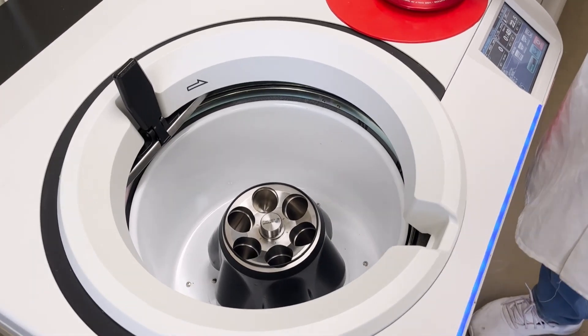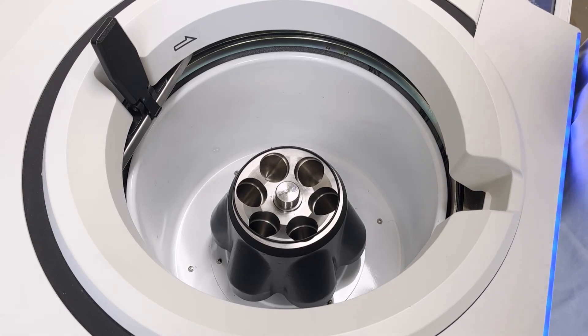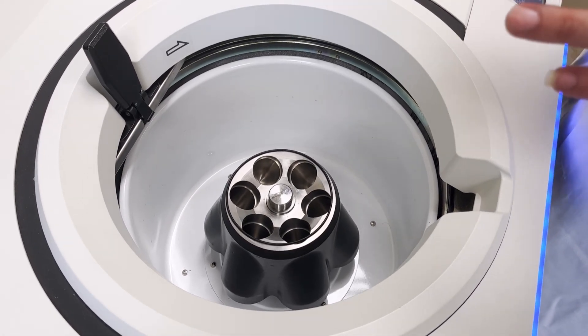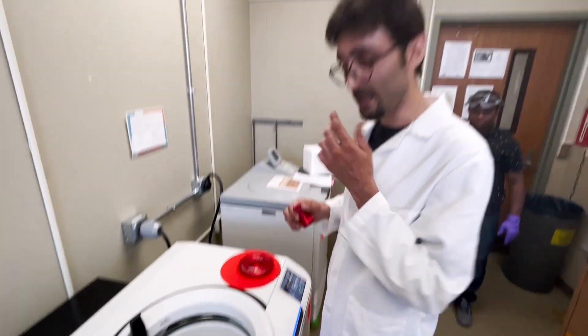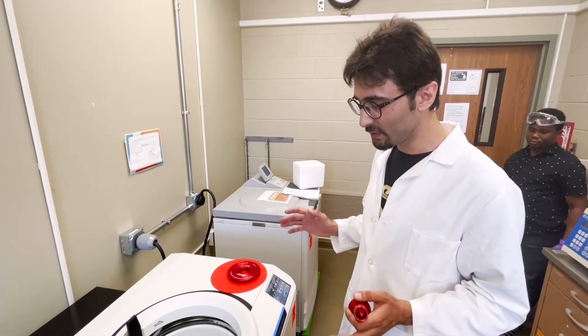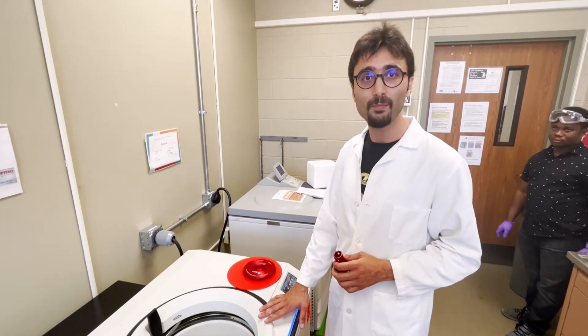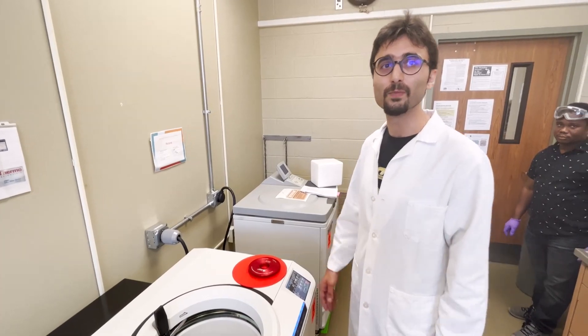The only important thing when putting your sample in is to make sure it is completely balanced to the milligram level, because these rotors go to extremely high speeds. If the balance is off, the machine will usually stop itself, but just make sure you have a good balance.